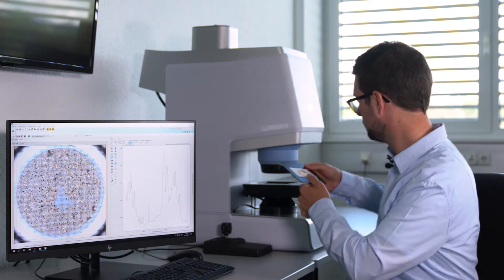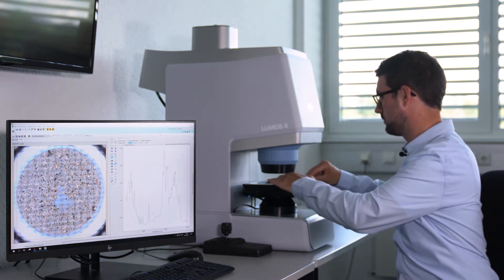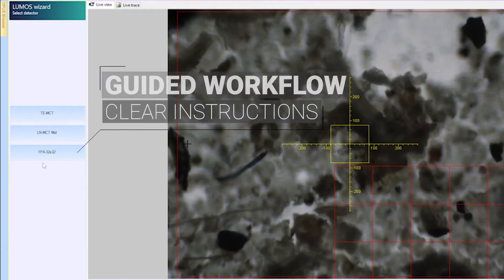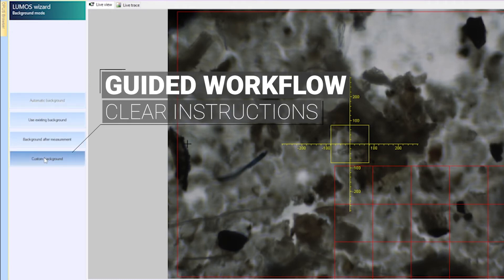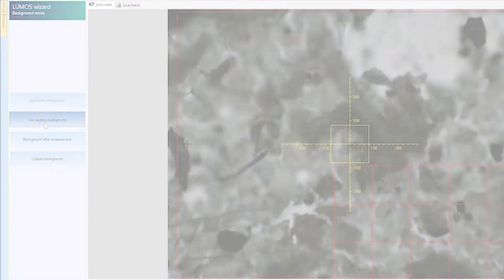The filter mounting is in fact the only manual step involved. Everything else is fully automated. The key to this is Opus, the control center of the Lumos II. Its clean interface guides the users through the analysis every step of the way by setting up the experiment.